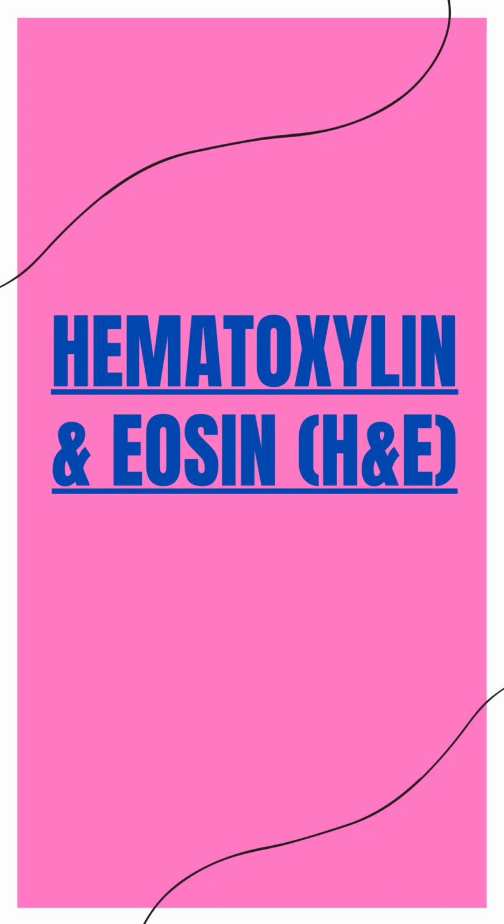This helps in identifying the number, size, shape, and distribution of nuclei, crucial for diagnosing malignancies, infections, and other pathological conditions. 2. Cytoplasm. The cytoplasm of cells stains various shades of pink due to the affinity of eosin to basic cellular components. The intensity of cytoplasmic staining depends on the abundance of proteins and organelles in the cell's cytoplasm, helping distinguish different tissue types.